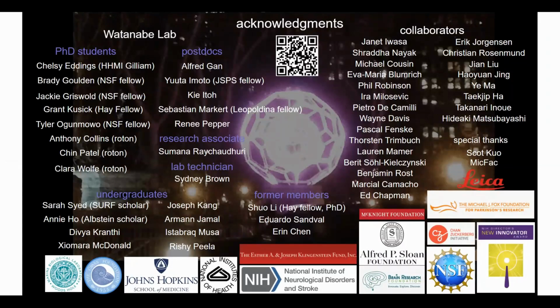So what we typically do for this sort of experiment is preliminary experiments on the light microscope, and then make sure that things like neuron activation are actually working in the setup. We basically do calcium imaging, and then make sure that synapses are responding to the stimulation that we apply. And so once we do these kinds of experiments, we can tell if the experiment actually worked or not.